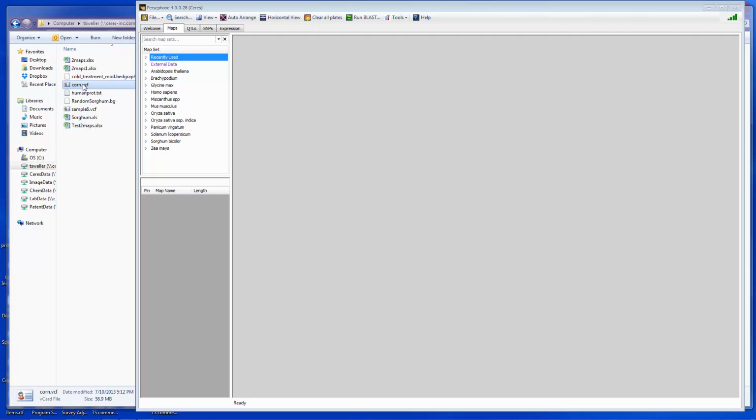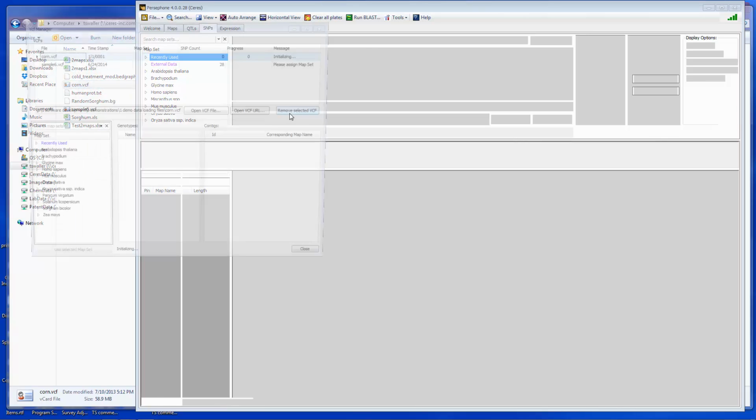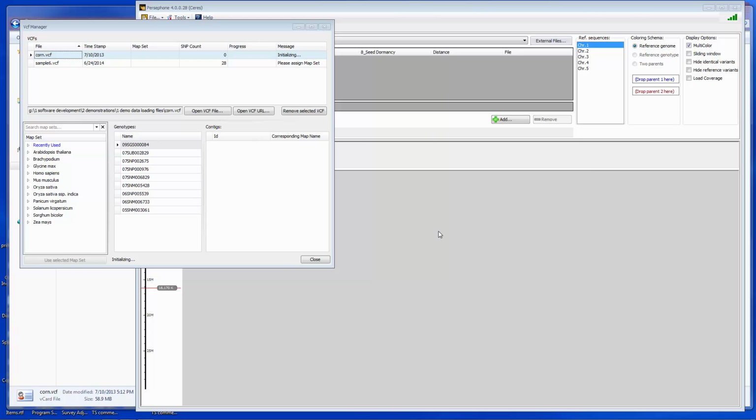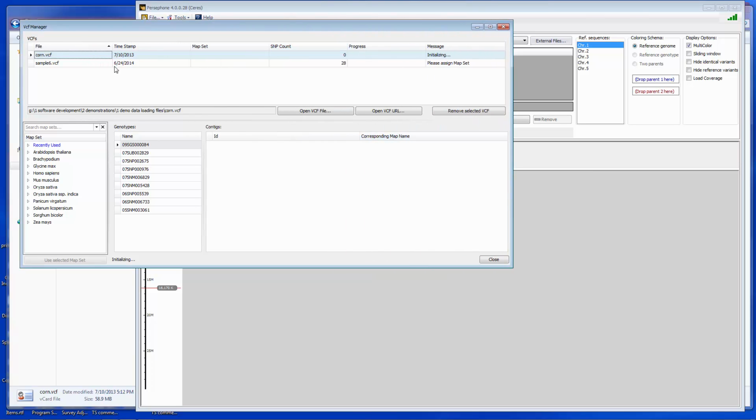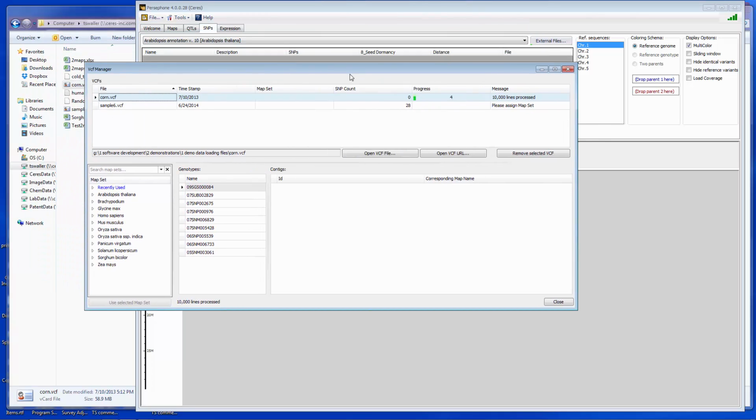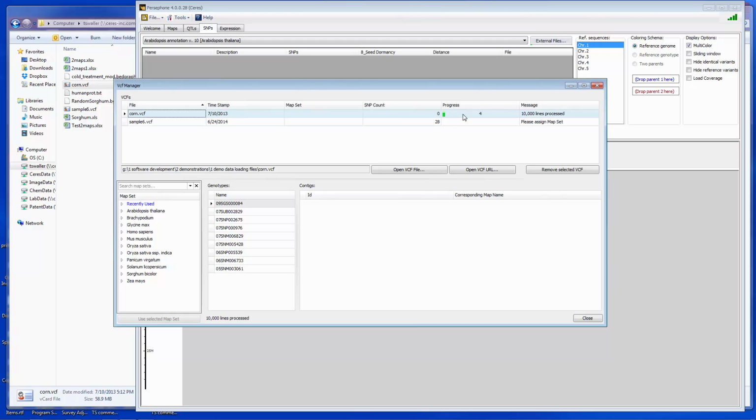So it's very easy to load a VCF file into Persephone. I take the file and I drag and drop it onto the main page on Persephone. Persephone then understands what file that is, starts loading that file immediately. And as you can see here, VCF files can be quite large in size, and so sometimes this will be a very quick process, and sometimes it'll take some time.